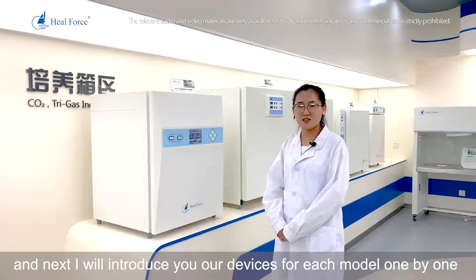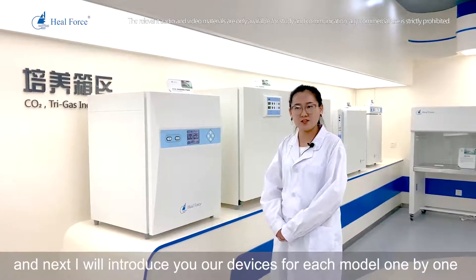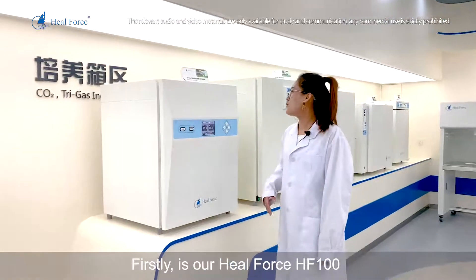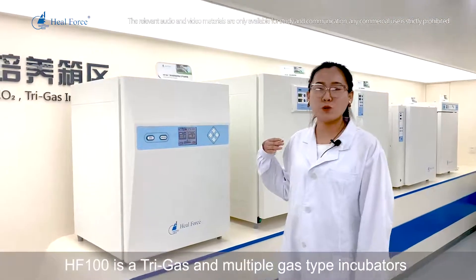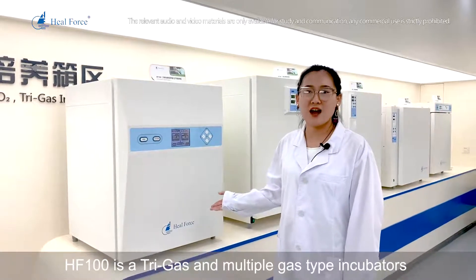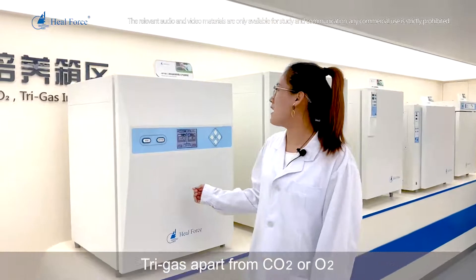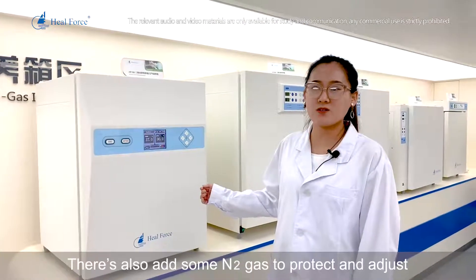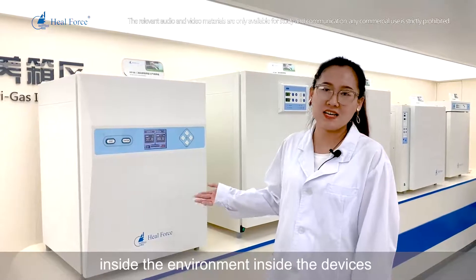Next, I will introduce our devices model by model. First is our HealForce HF100. The HF100 is a tri-gas, multiple gas type incubator. Tri-gas means that apart from carbon dioxide and oxygen, nitrogen gas is also added to protect and adjust the environment inside the device.